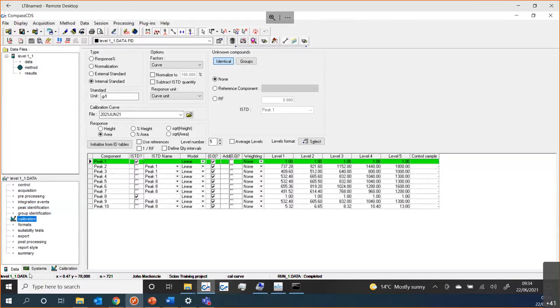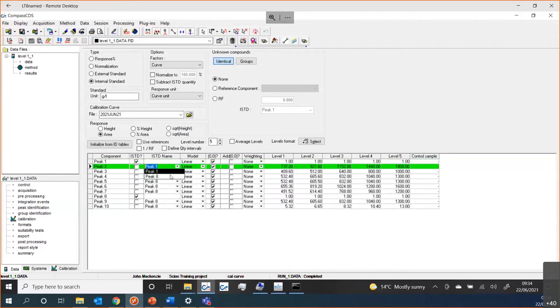I did anticipate that my system wouldn't work and did actually prepare these a little bit ahead of time. You can see from the data file, I have two internal standards. I can select which peak is going to be my internal standard and I can also select for every other peak which internal standard I intend to use for that one. You are allowed almost as many internal standards as you like, associated with the peak of interest, to ensure the best match in performance and response from the GC for your internal standard calculation.